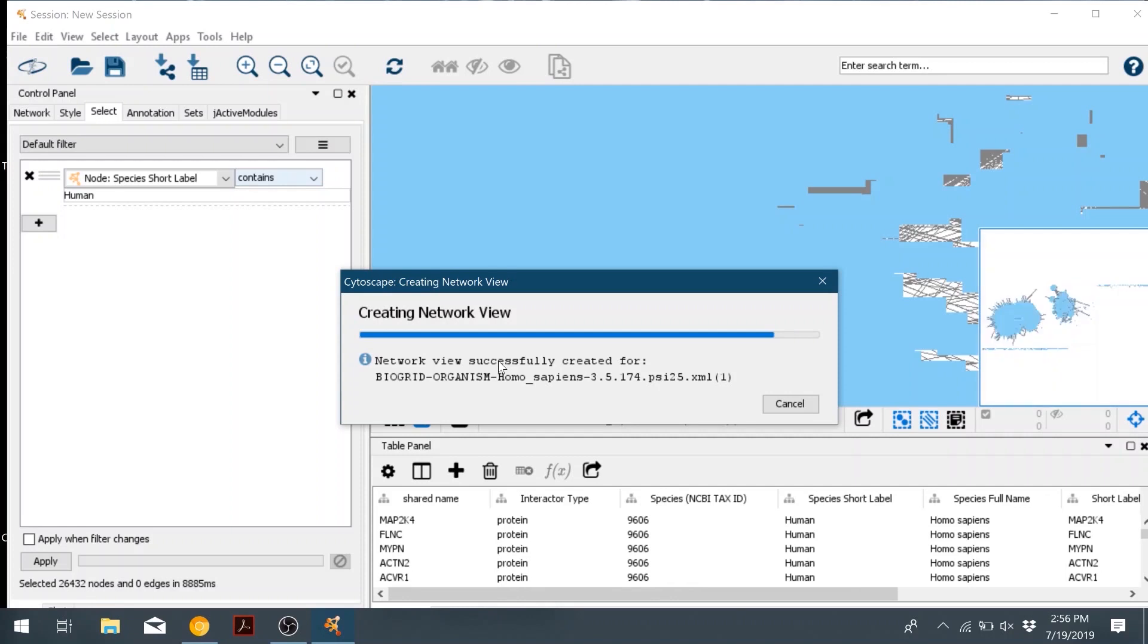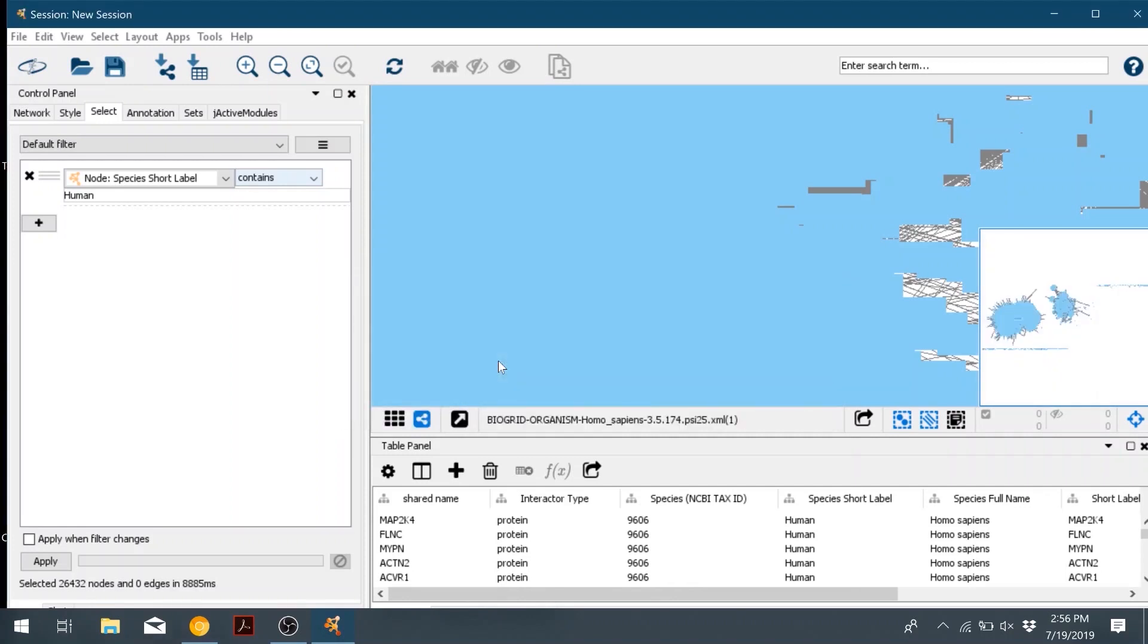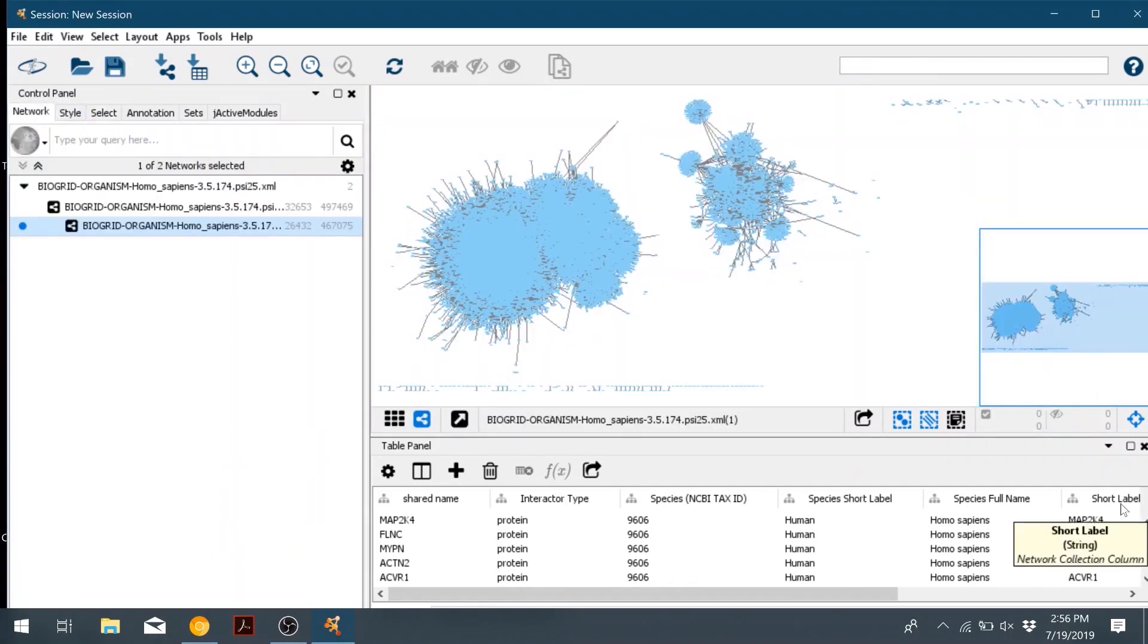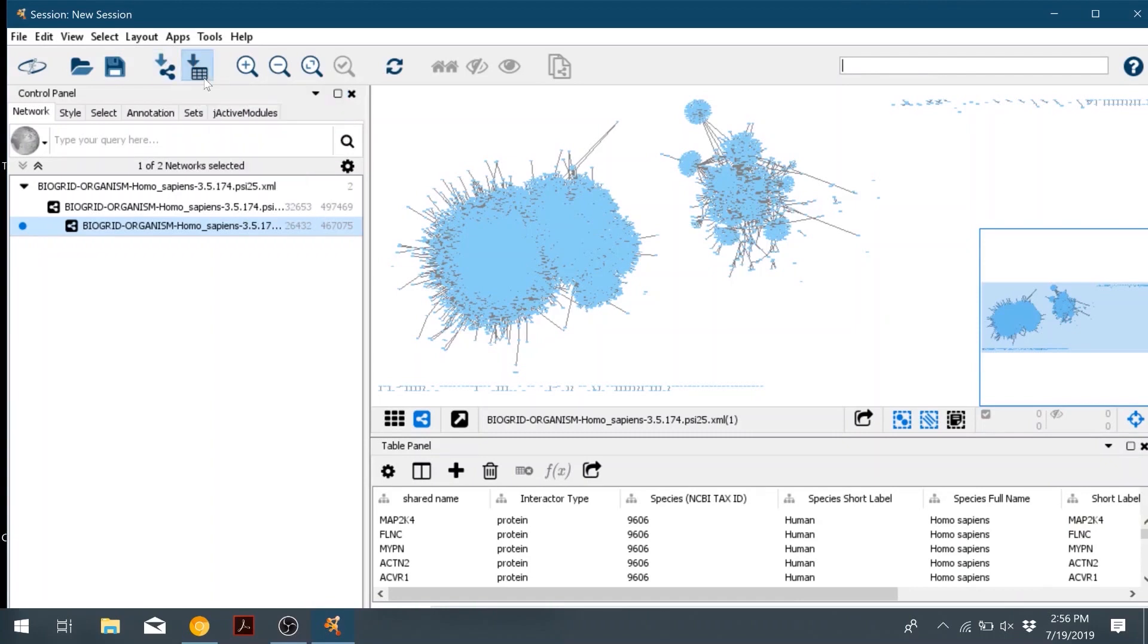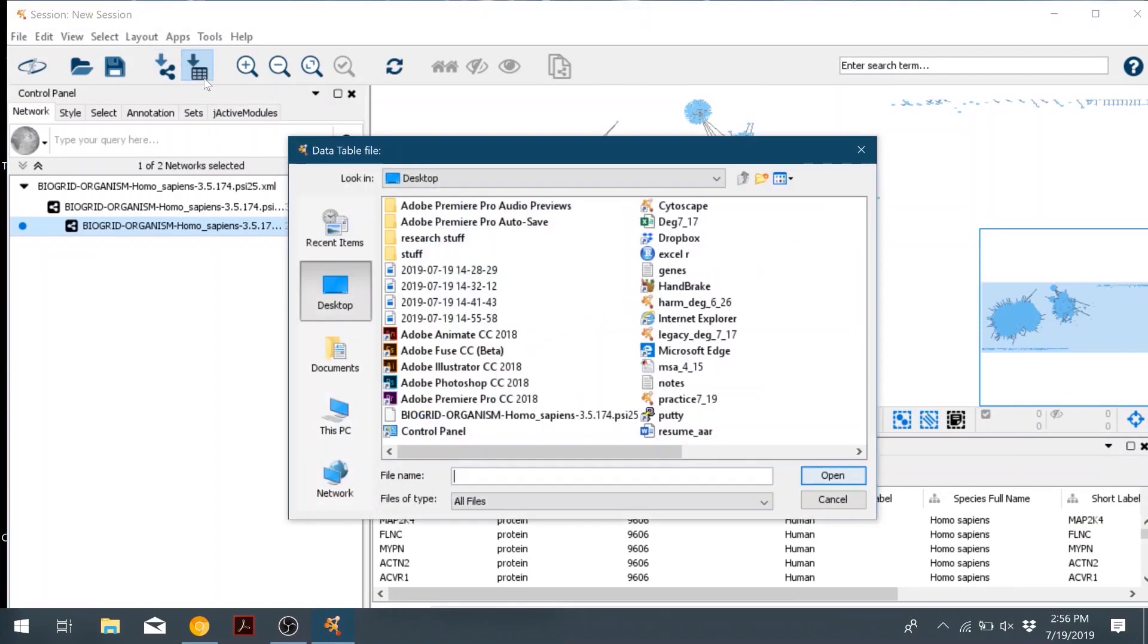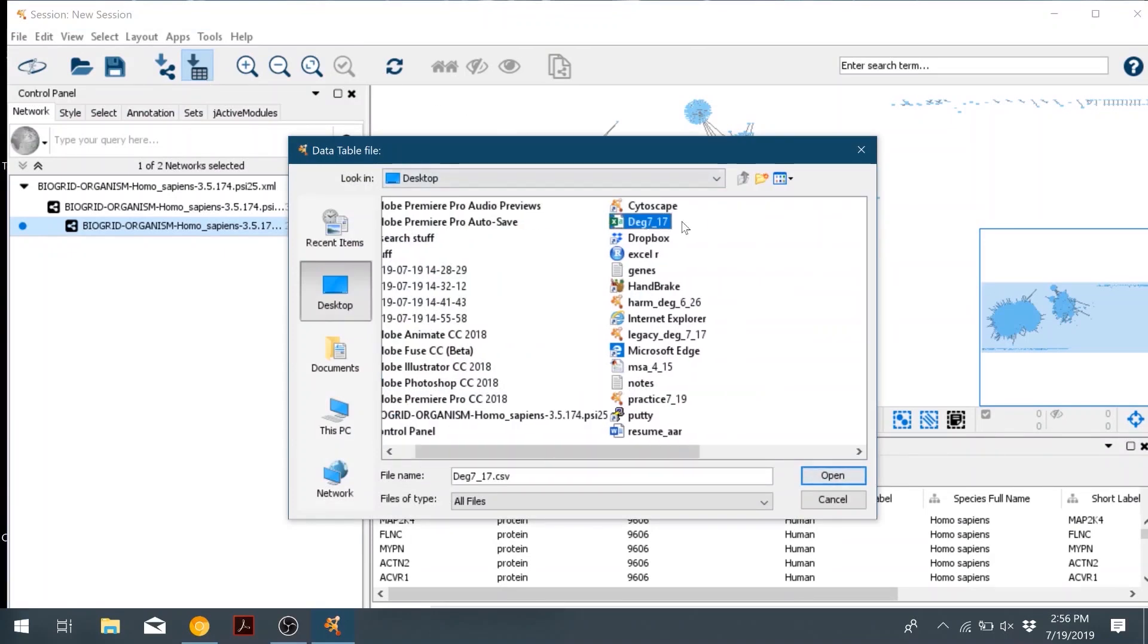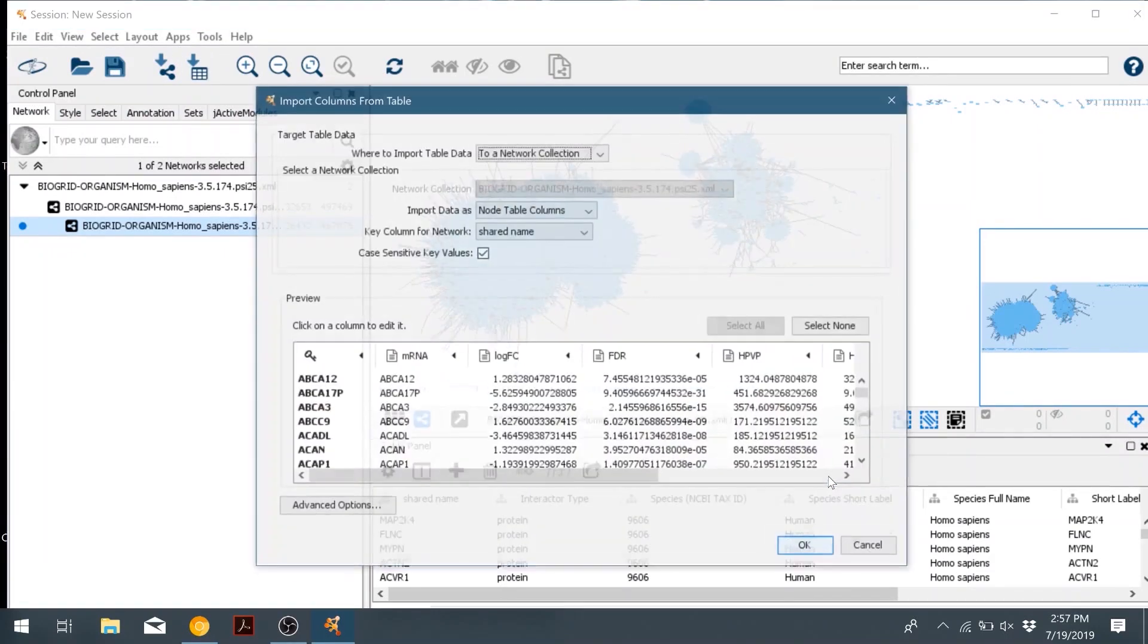So now we're going to add our differentially expressed gene information to our network. We're going to go up into the top toolbar and click on the import data from table, and then we're going to select our CSV file.